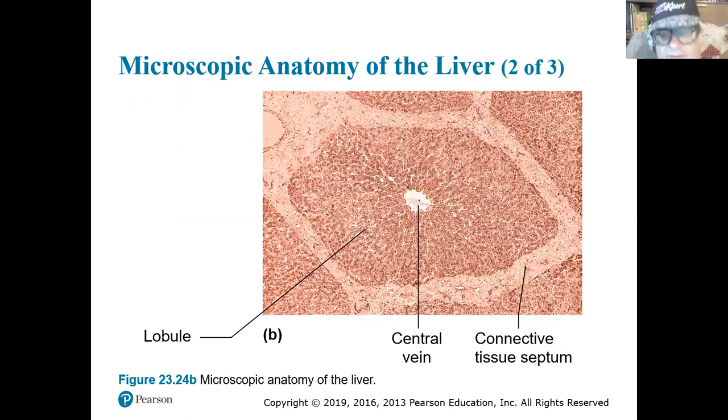All right. Oh, there's a nice zoom in. Okay. So the central vein, and if you look, you see these spaces, these sinusoids, as the blood has to percolate through there, all of the cells that are going by, all the hepatocytes, they are looking for things that don't belong and trying to kill them out, kill it or take it out. What you're seeing right here, that vessel, that vessel, that vessel, those are the portal triad. So, and you can see again a group of 3 right there in each corner usually.